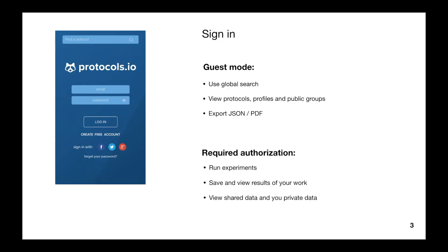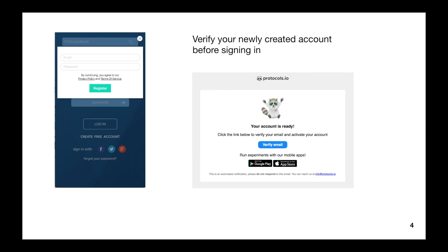When you just install the app, on the first screen you see a login form. For non-logged-in users, we allow searching data and viewing user profiles and public groups. But if you want to run an experiment or comment on any protocol, you should create an account — it's free. When you create an account, you have to verify it via a received email before signing in. You can also sign in via social networks or use an already created account.